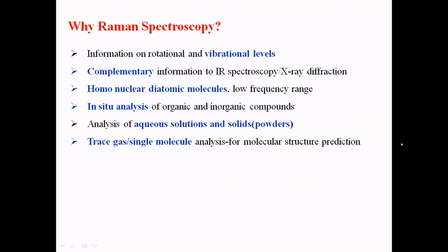And why do we have Raman spectroscopy, why are we so interested in doing Raman? It is very simple, because we easily get information about the vibration levels: which kind of vibration it is, either symmetric stretching, anti-symmetric, or rotational, what kind of vibration level a material has. We can easily get these things. And of course, it's a complementary technique to IR spectroscopy. Maybe in the next slides, I'll talk about some key differences between IR and Raman. Of course, this technique gives structural information.